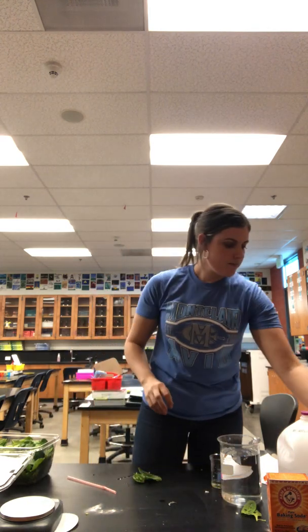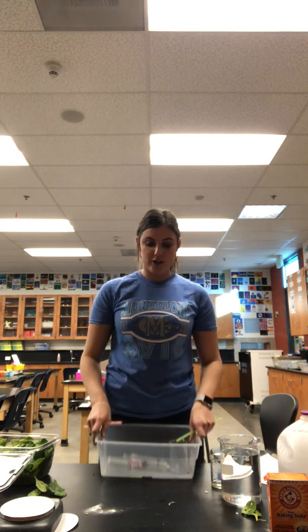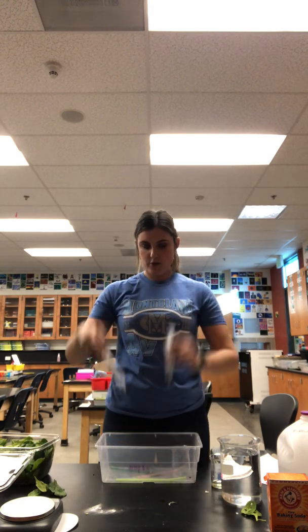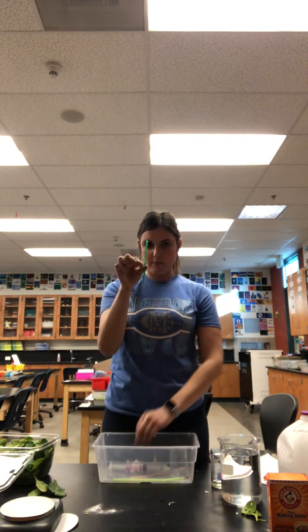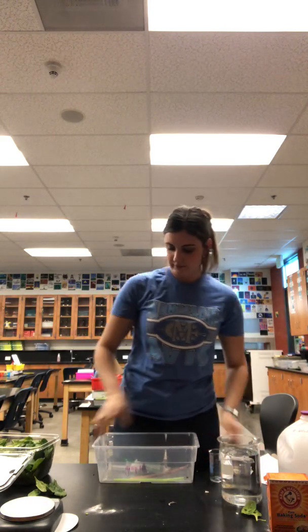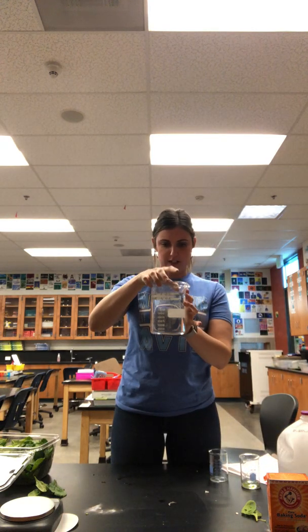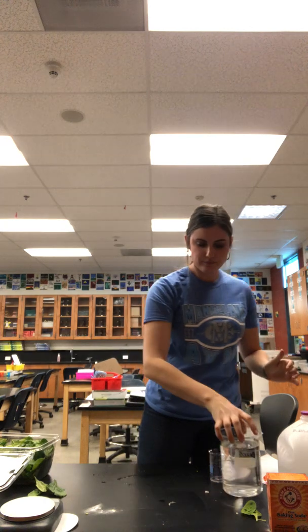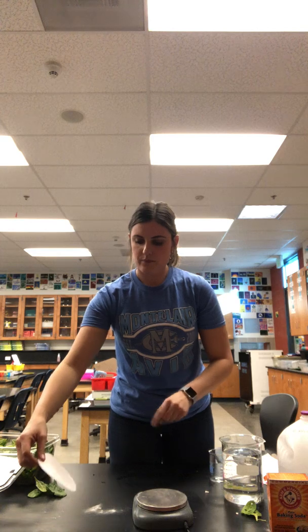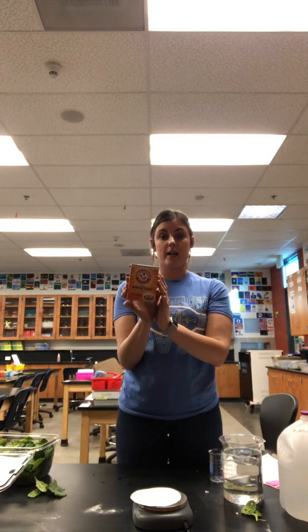Before we begin, everyone should check their boxes to make sure that they have all of the correct materials. Be sure we all have 2 plastic straws, 2 plastic syringes, 1 plastic stirrer, 2 small beakers, and 1 large beaker filled with 1,000 milliliters of water, as well as a scale, filter paper, and baking soda, also known as sodium bicarbonate.